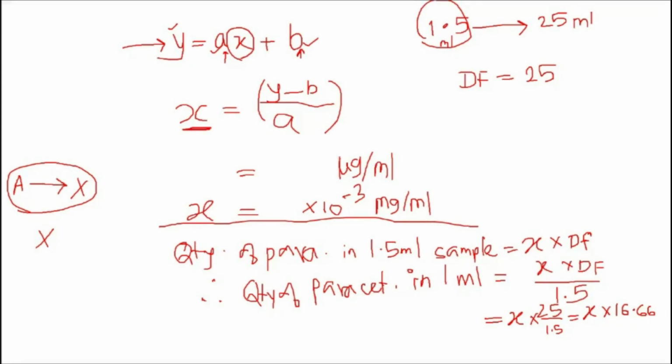Okay, now this concentration you have got by using the equation of linear regression. Now there is one more method to calculate this concentration. Which is that method? Can you please tell me? Graph. Yes, the other method is by graph. Excellent. Okay, in the graphical method, again we need to use the formula y is equal to.